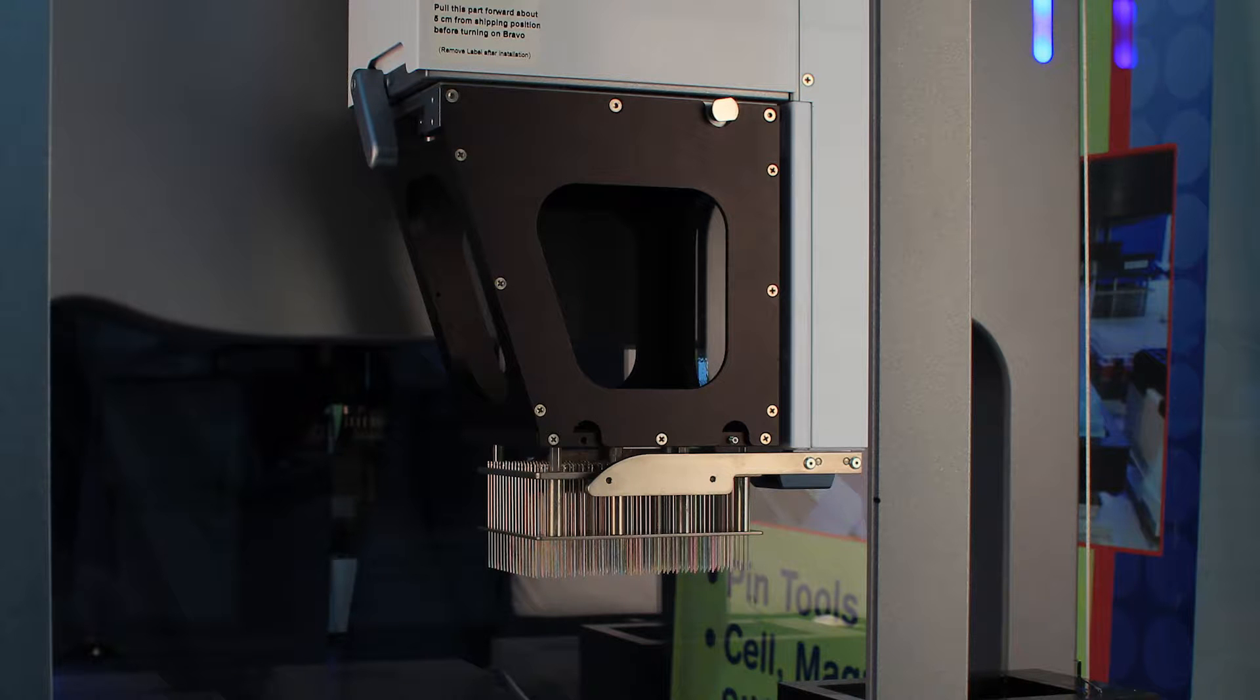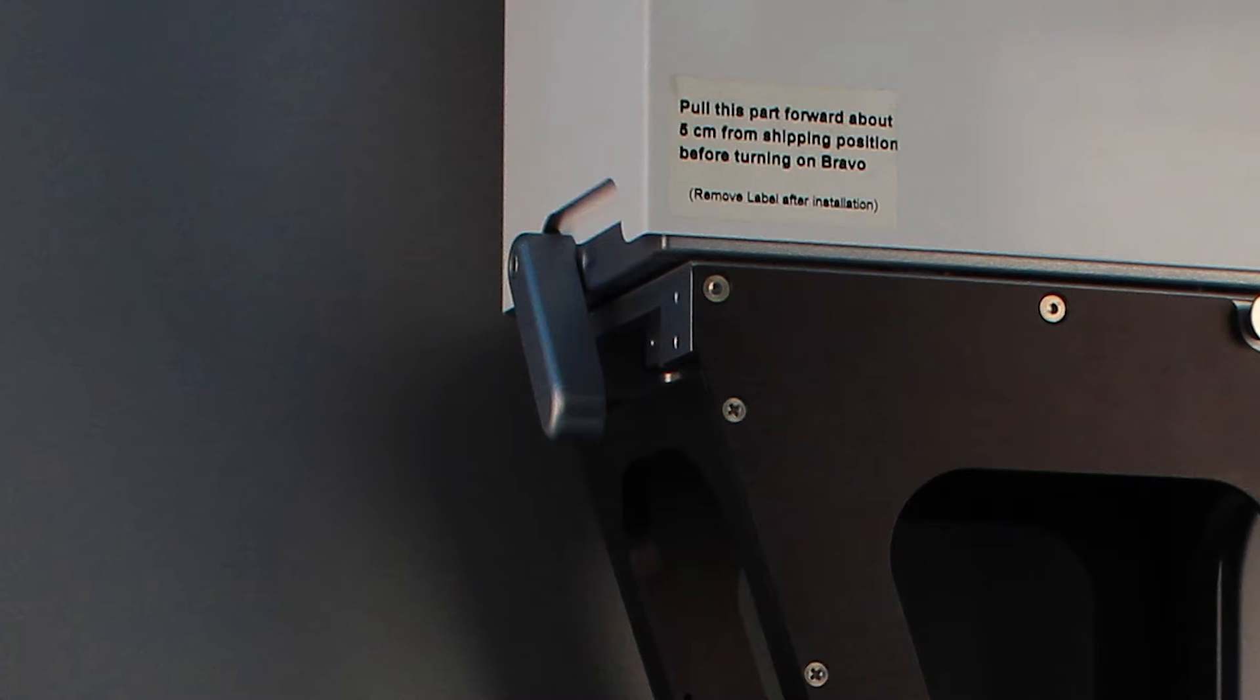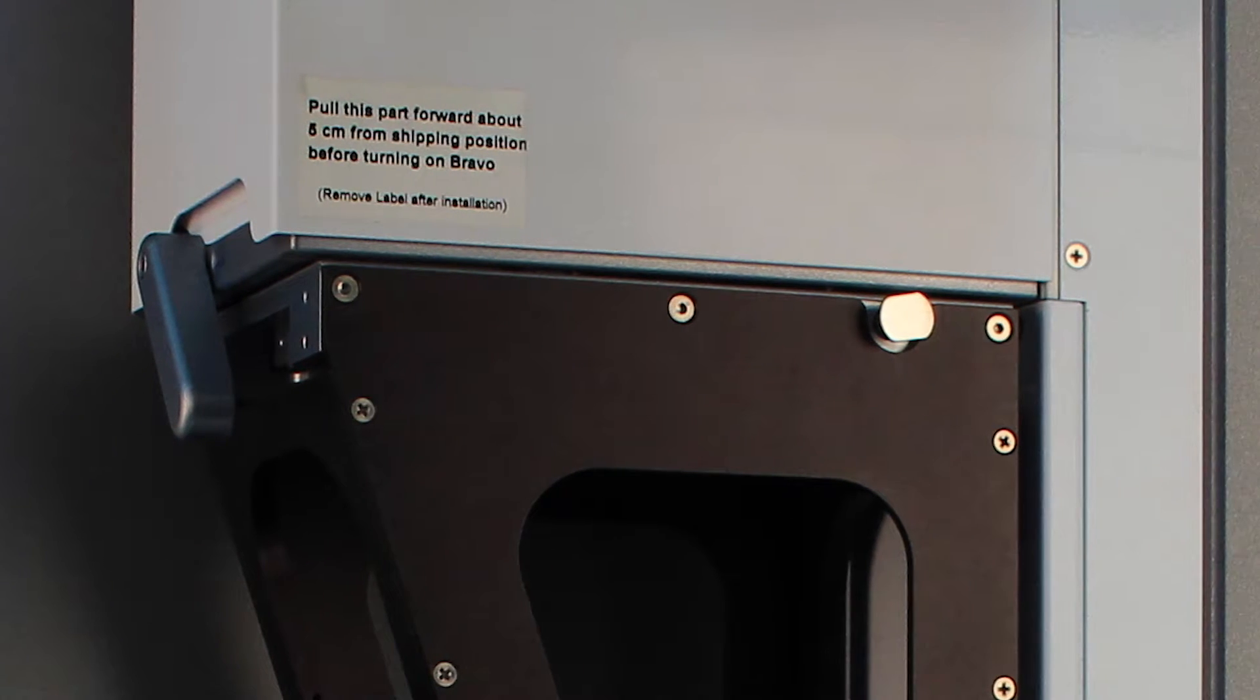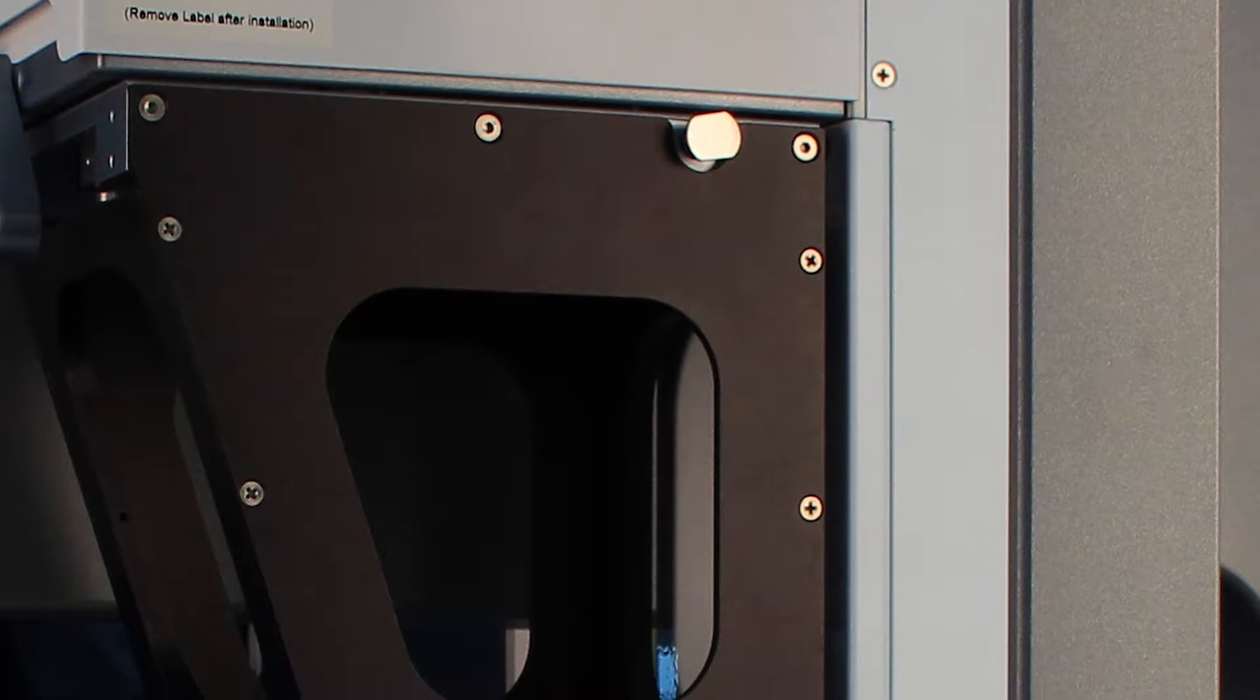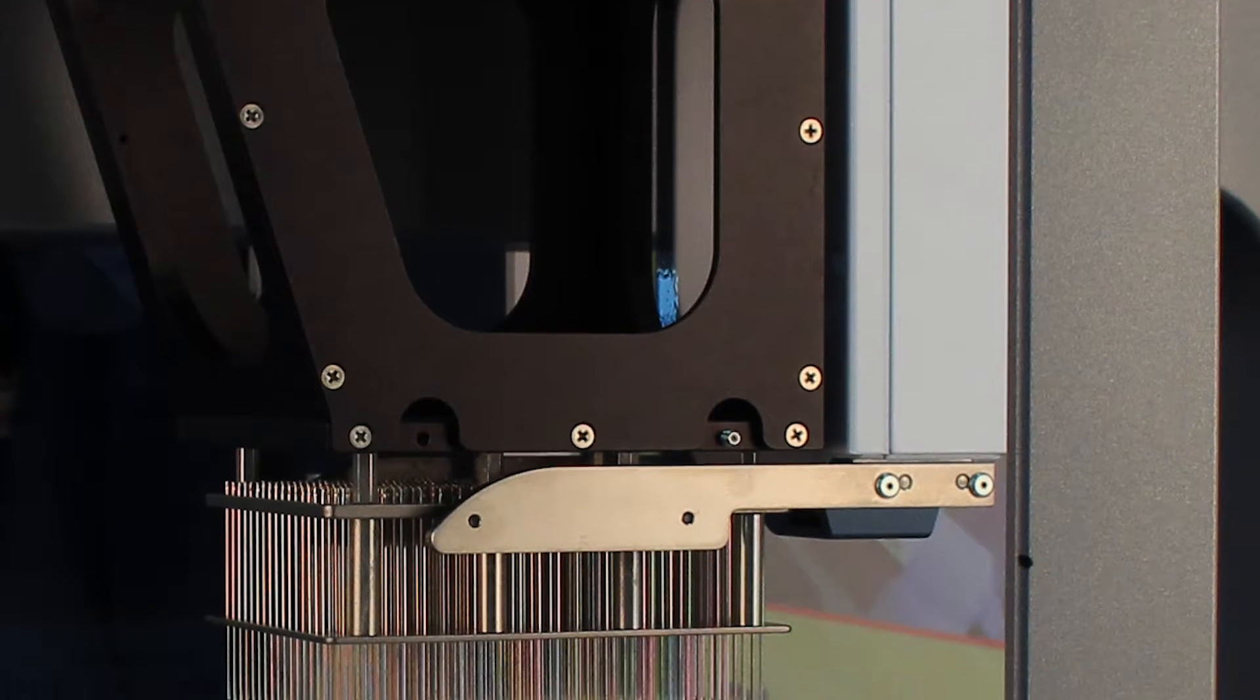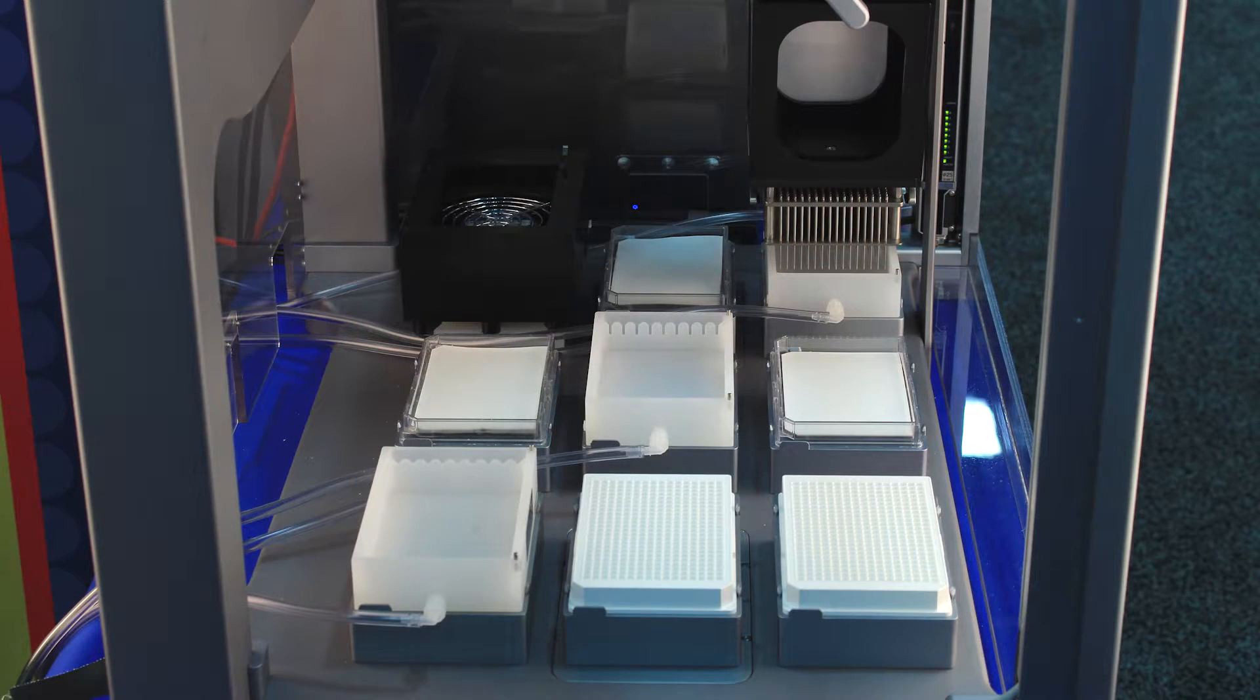The pin tool is mounted to the head using VMP's mounting hardware. A typical configuration consists of several wash accessories as shown here on the Bravo deck.